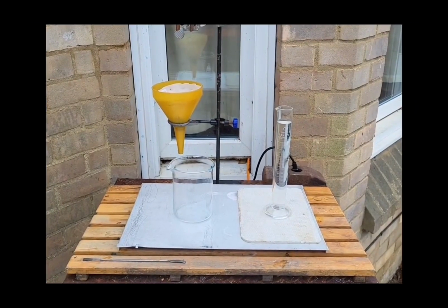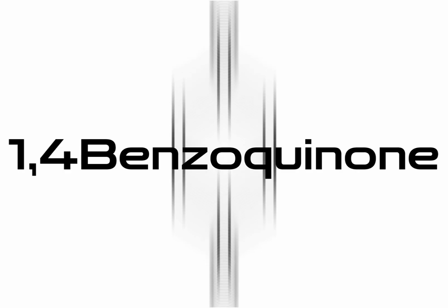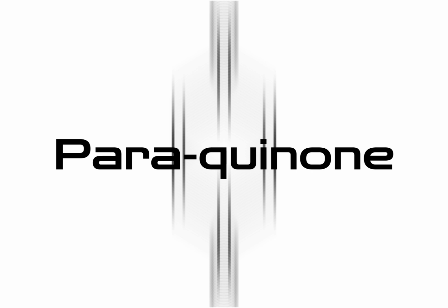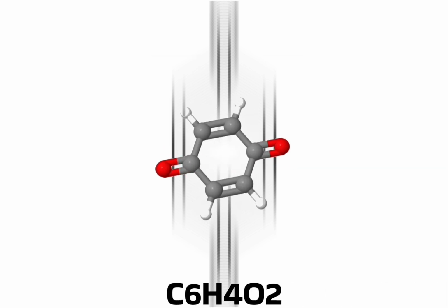Today we are making benzoquinone. Benzoquinone, also called 1,4-benzoquinone or paraquinone, is a planar six-membered ring compound with the formula C6H4O2.